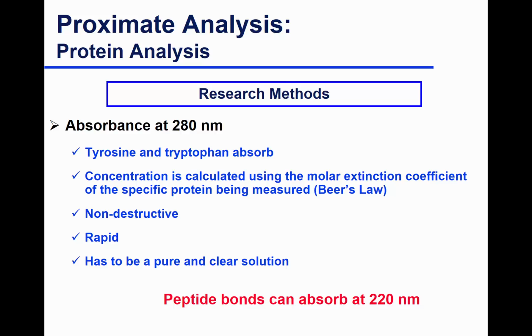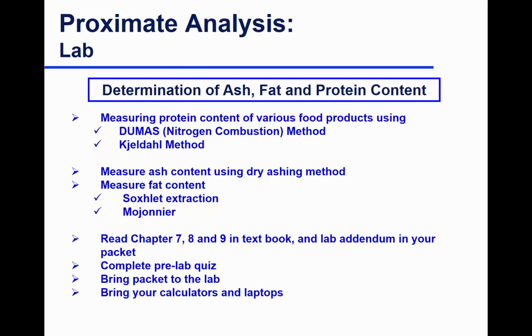Last point I want to make here. If you didn't want to generate a standard curve, you could just use Beer's law to measure your absorbance, or you could also do a standard curve with proteins at various amounts. Any questions on any of this? Well, that's what I have for you, because we've already gone over what you need for that.